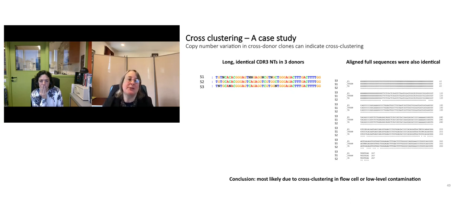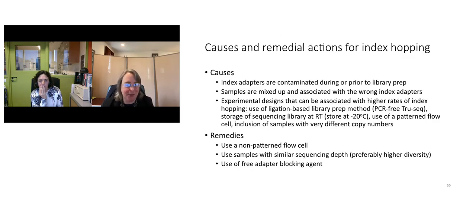And if you drill down on the sequences, they will have the identical CDR3 nucleotide sequence, and also the fully aligned sequences will be identical. So again, that puts you in a bin of it's either cross-clustering or contamination. This is not biologically an interesting result. It's a depressing result.